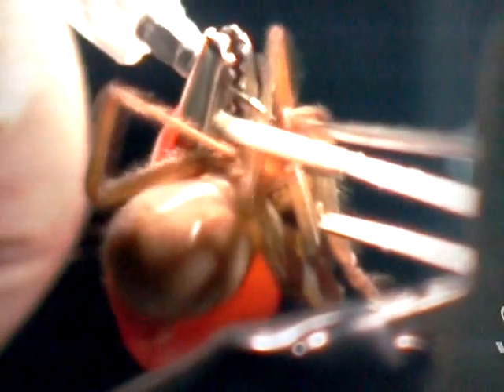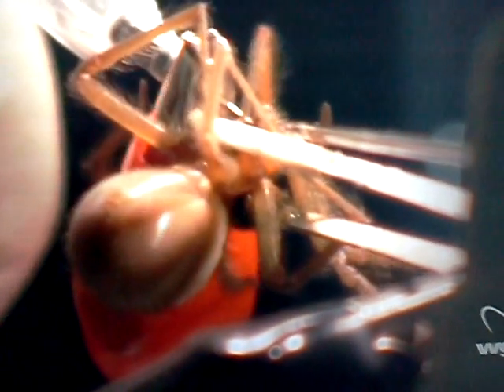You'll see there's about 12 volts of electricity going through the spider, and that causes all the muscles to contract, including the venom gland. There it goes — you've got all that venom.